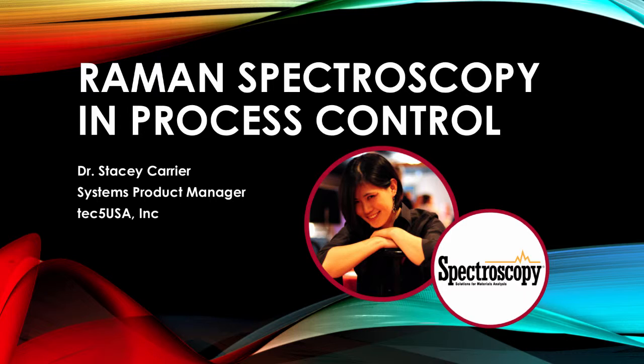There are numerous methods out there looking into enhancing the signal, and we're talking about surface-enhanced Raman, tip-enhanced Raman, coherent anti-Stokes Raman scattering. All of these techniques are designed to enhance the Raman signal, but when you're looking at process control, you don't always have the time to wait to enhance the signal as much as necessary.